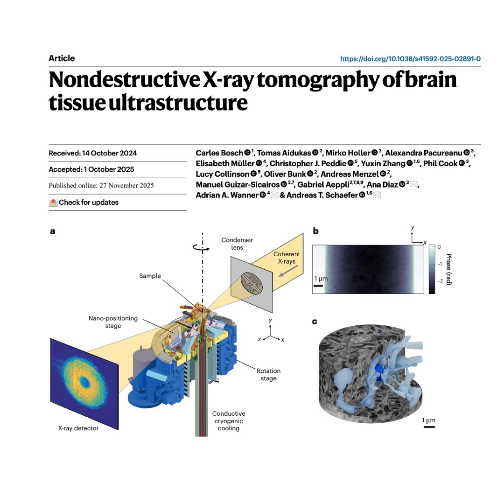And that's why the community has been looking for a long time at an alternative, X-rays. Right, because X-rays have this immediate tantalizing promise. They can pass through millimeters, even centimeters of tissue, which suggests a non-destructive large-scale mapping solution. So why haven't we been using this all along? What's the catch? The catch is the resolution trade-off.